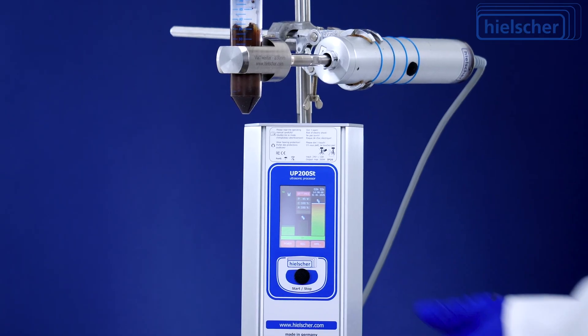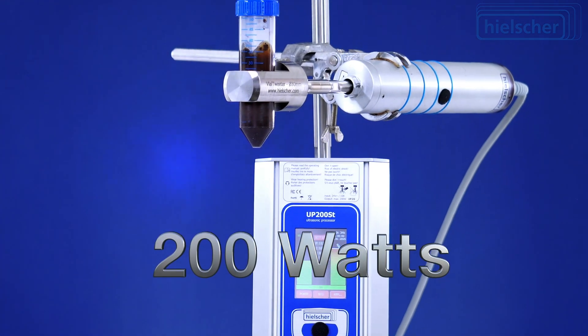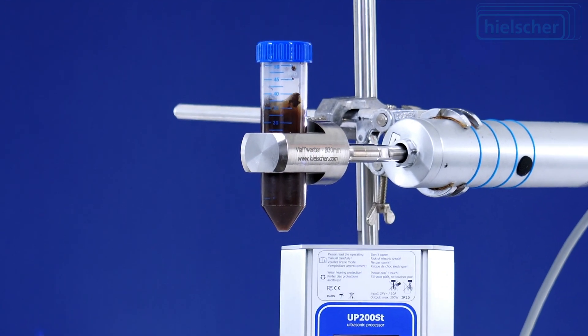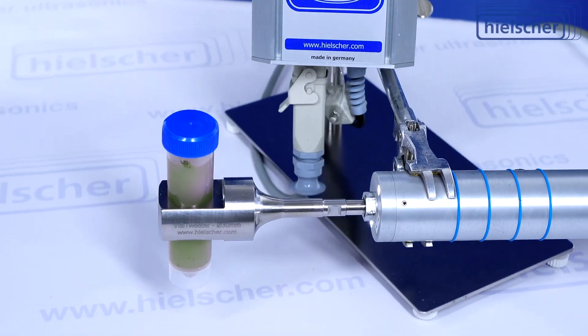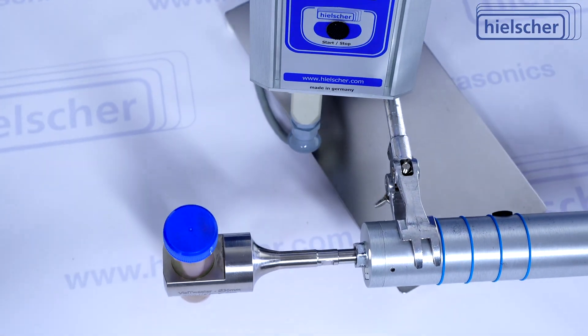This sonicator delivers up to 200 watts of intense focused ultrasonic energy directly through the tube wall, providing an 18 micron amplitude that's nearly 20 times more than a standard ultrasonic bath.